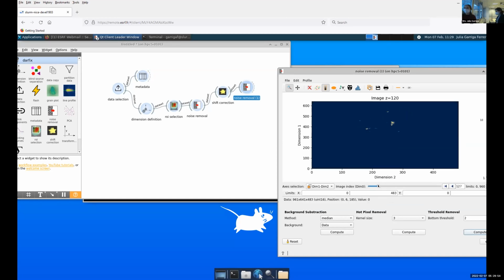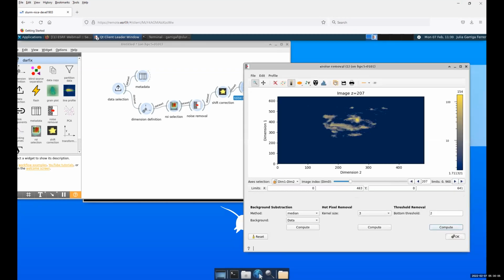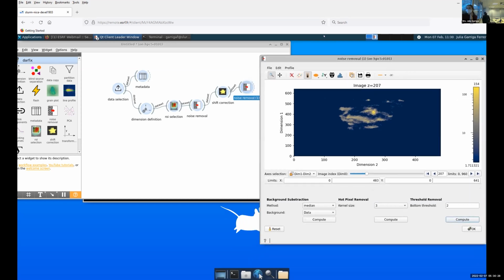How are you, Peter? Does it work okay on your side? Yeah, I'm placing more or less the ROI. Okay. Anyway, the parameters of each item can be modified afterward. Let me just do the shift correction. Yeah, don't worry. We can wait for you. There's not a lot of widgets left, so we can wait for you 2 minutes. And then we can do it all together. In the meantime, if anybody else has any question or has found any problem.